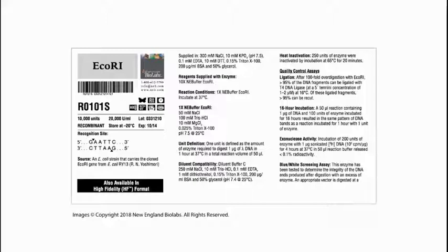It comes from E. coli. It was one of the first restriction enzymes ever found. That's where the name comes from: E. coli, restriction enzyme 1. And when you buy it, it comes in a tube. This tube has 10,000 units of EcoR1, and that unit tells us what the activity is. One unit is defined as the amount of enzyme required to cut a microgram of phage lambda DNA in 1 hour at 37 degrees in a reaction volume of 50 microliters. So that's an example of what we mean by the activity.